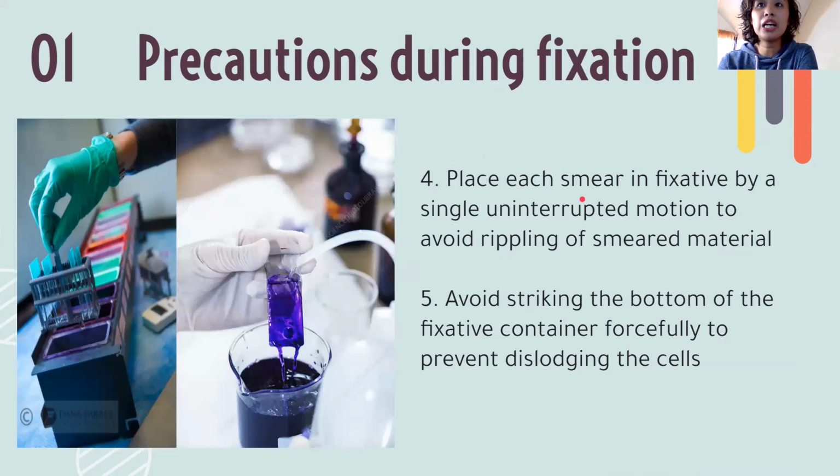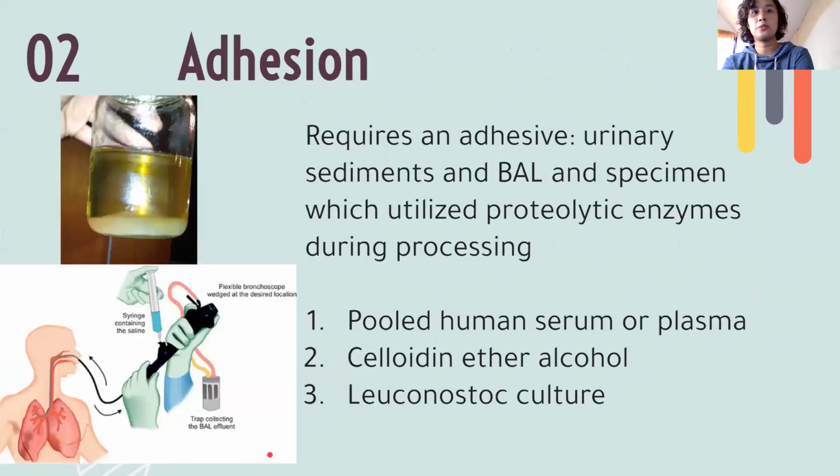Place each smear in fixative by a single uninterrupted motion to avoid rippling of the smear. So, single, uninterrupted. So, pagkapasok mo, itaas mo agad. Yun. Avoid rippling of the smeared material. Avoid striking the bottom of the fixative container. Yan. So, don't strike. Wag mo iaabot. Wag mo itatama sa bottom of this container to prevent dislodging of the cells.